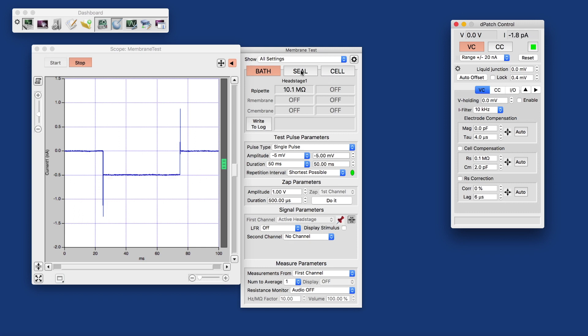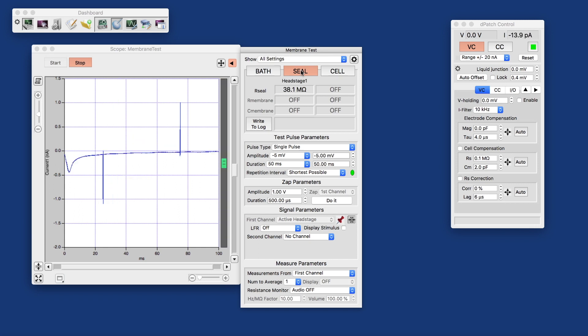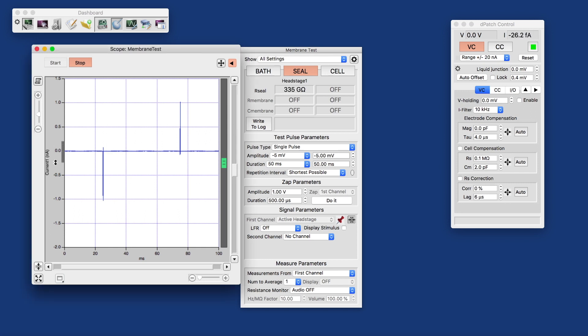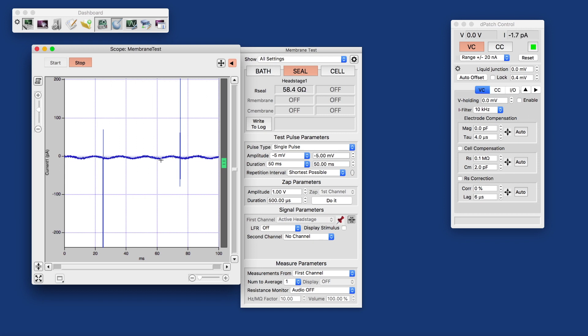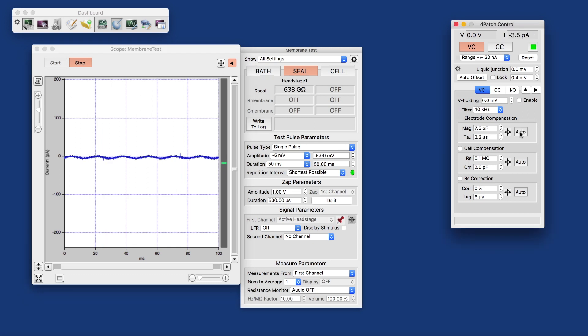As we simulate approaching the cell with the pipette, we switch to seal. And that forms a seal, so we now have a seal of many gigohms and our line frequency noise on this.